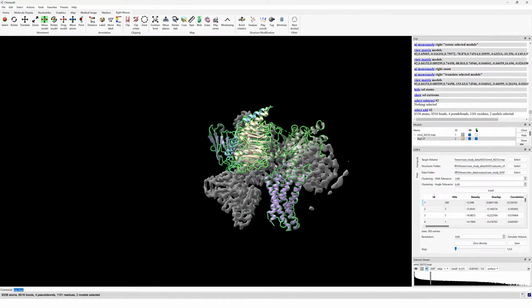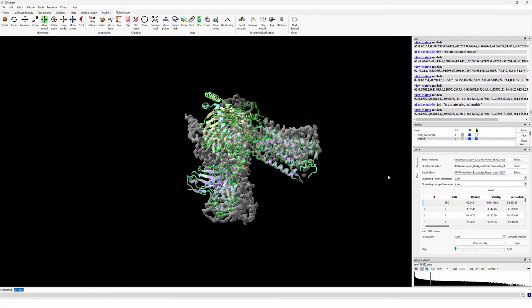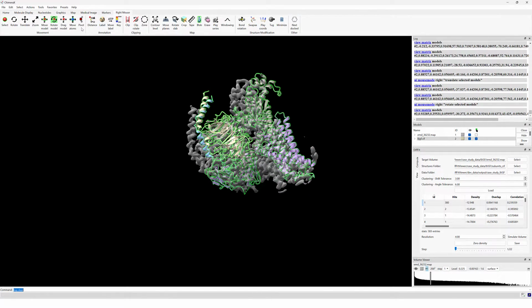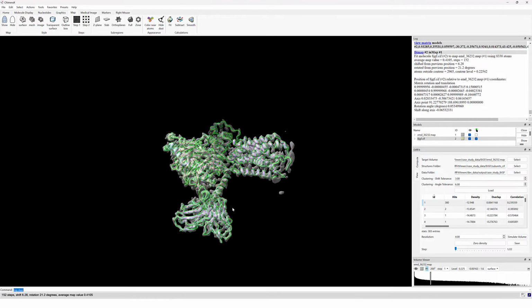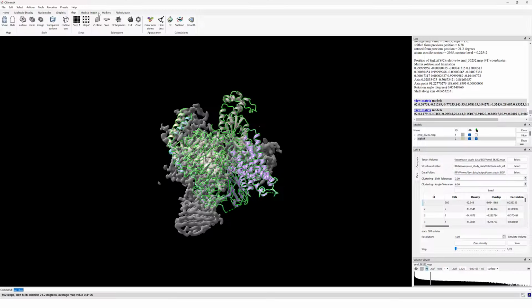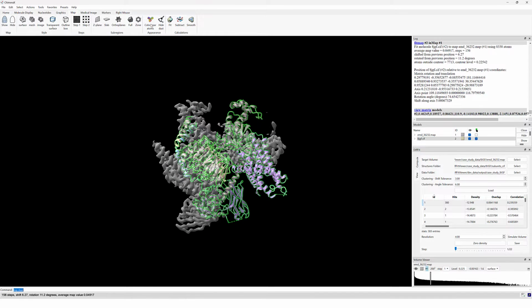However, this process first needs to manually align the structure to the approximate final solution. Otherwise, the outcome falls into a local minimum, meaning the alignment is far from ideal.